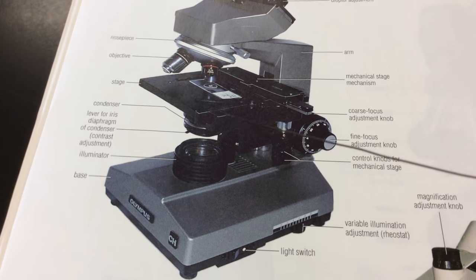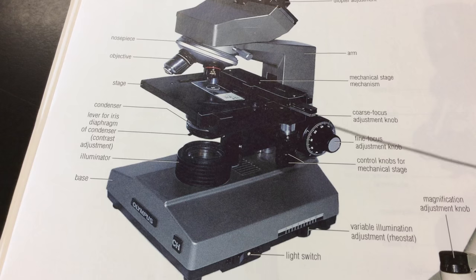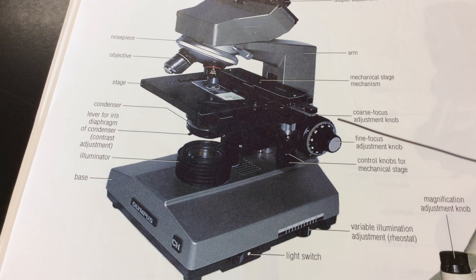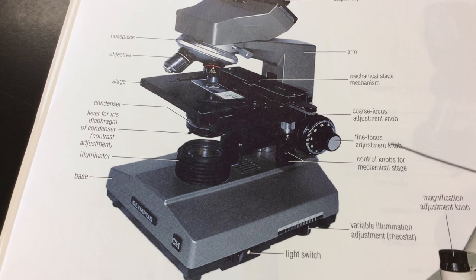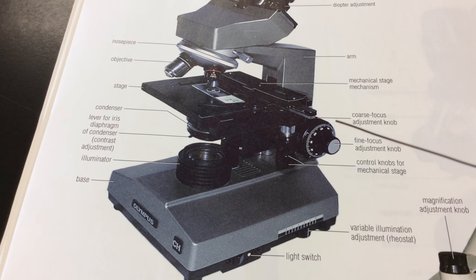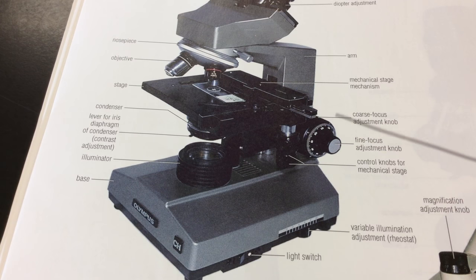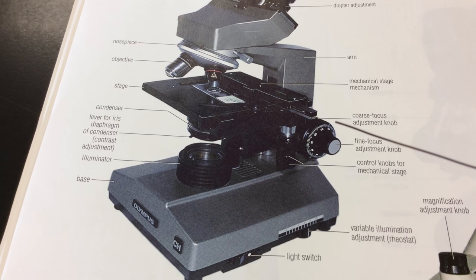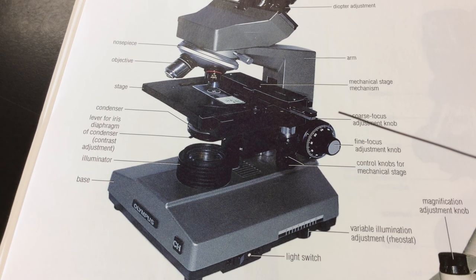Now moving over here towards the base of the microscope, we see two really important knobs. These are the focus knobs. And there's some really important rules we need to remember with the focus knobs. So the outer knob, called the coarse focus knob, will move the stage up and down in large increments. We only use the coarse focus knob using the short scanning lens and low power lens.